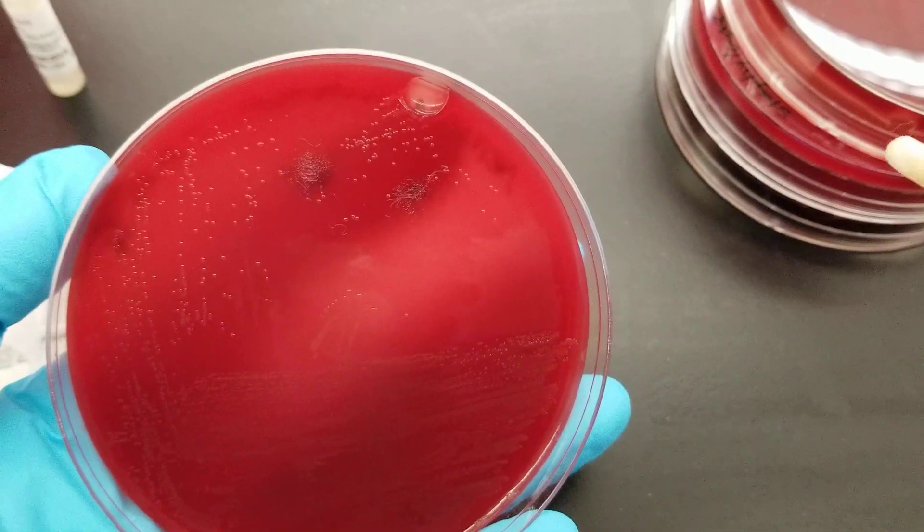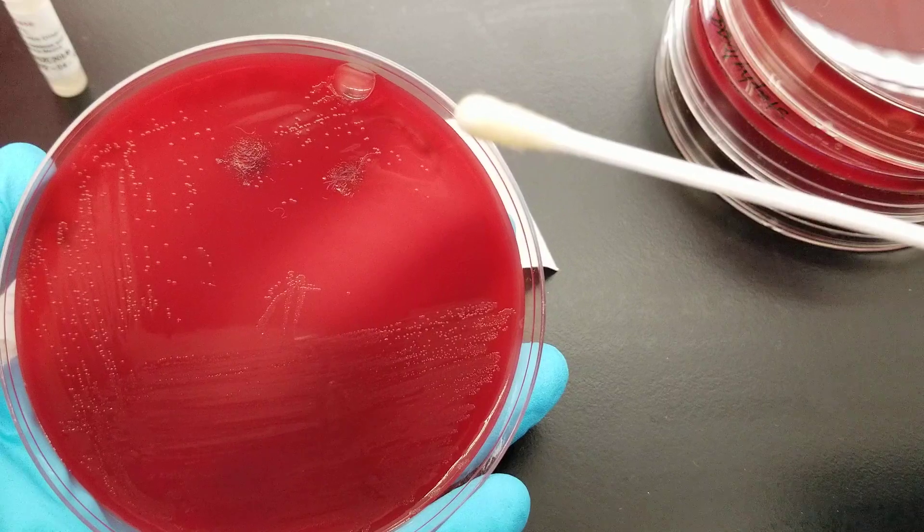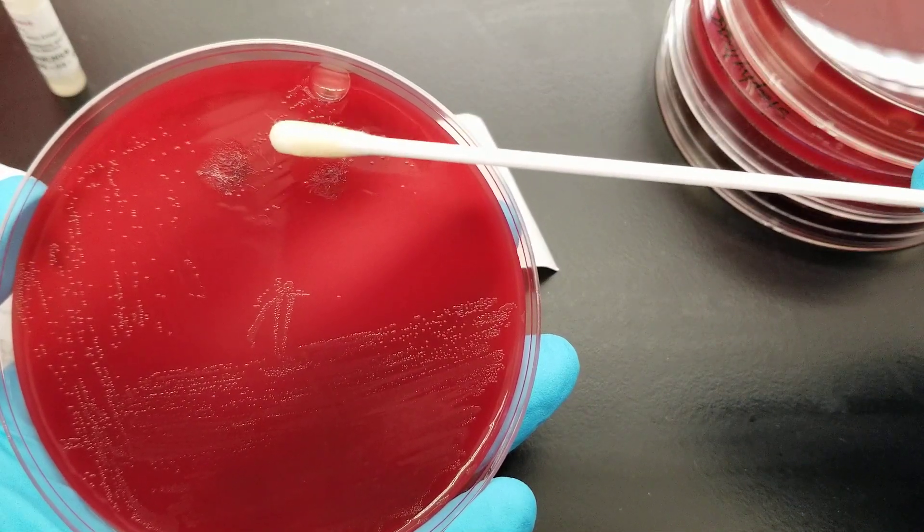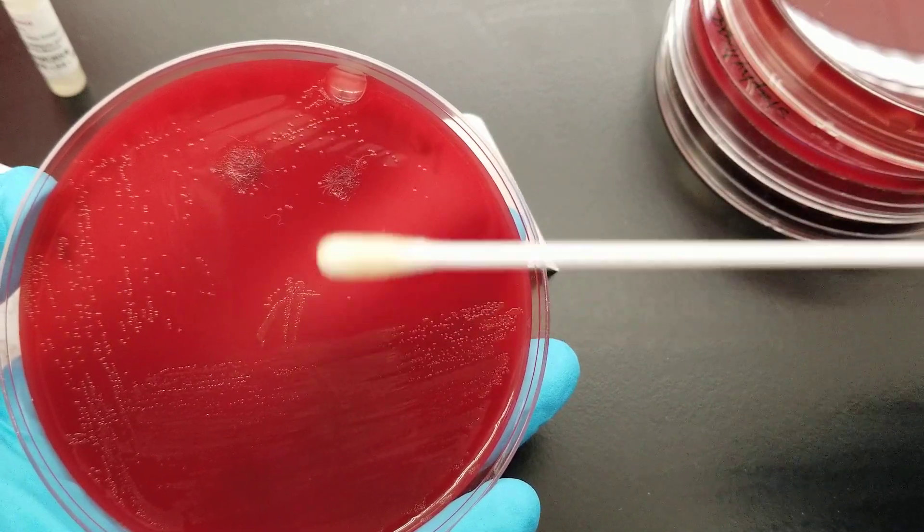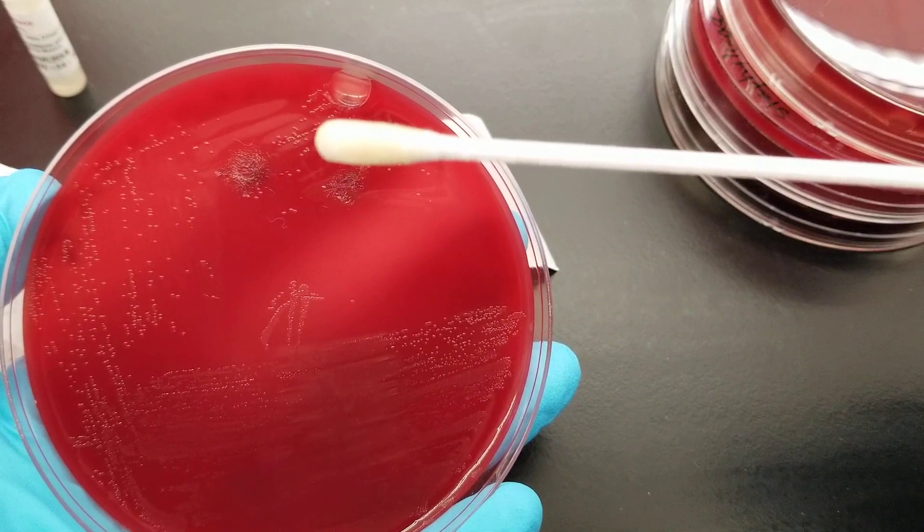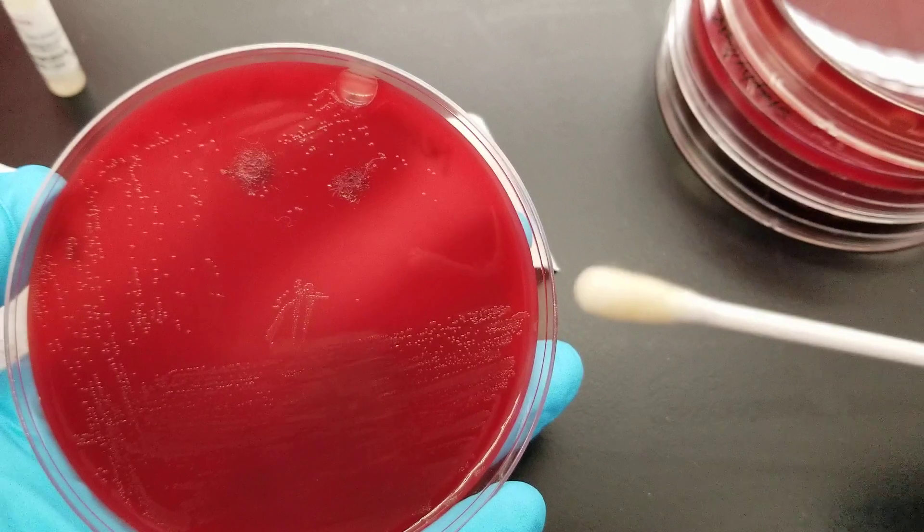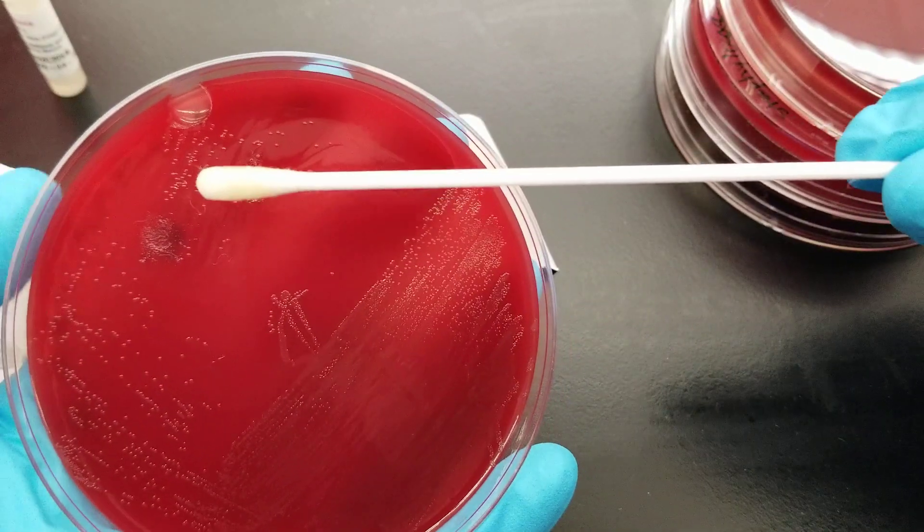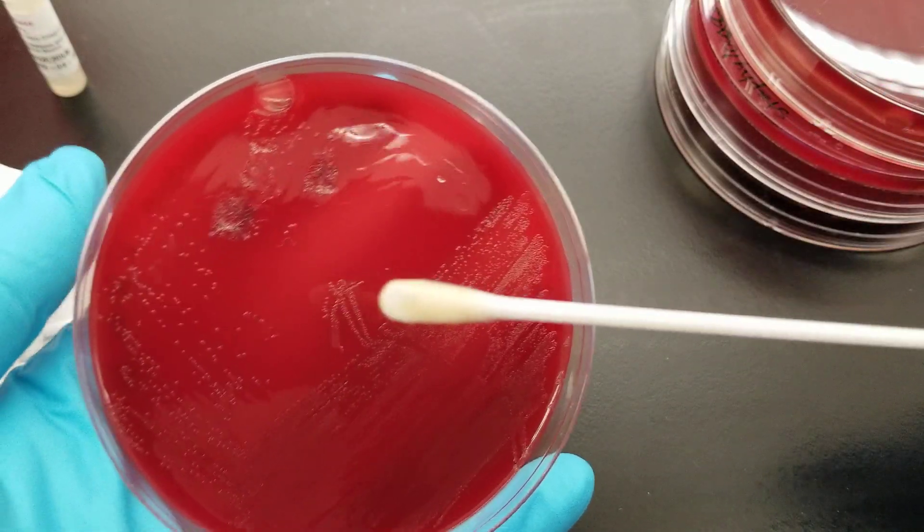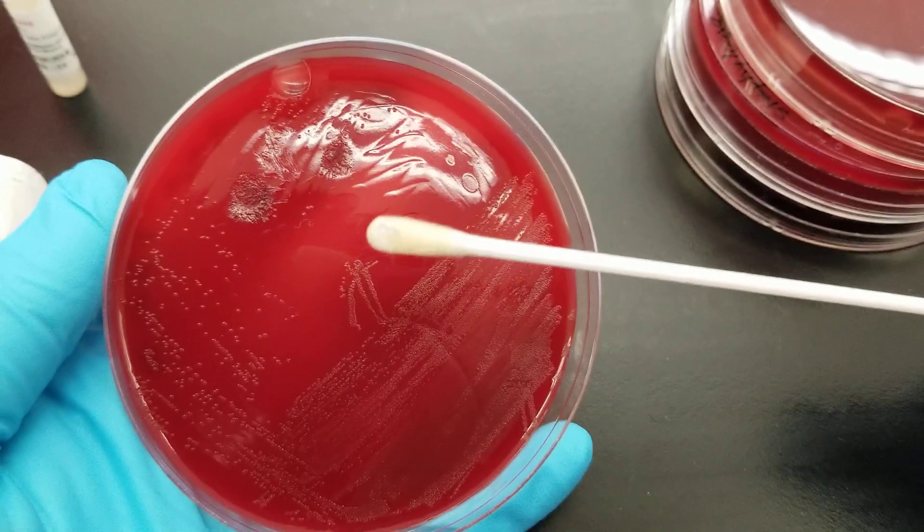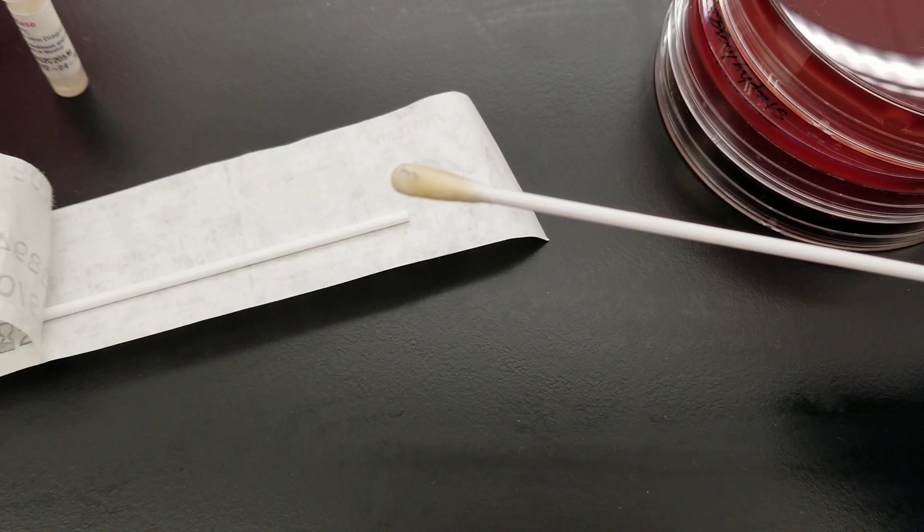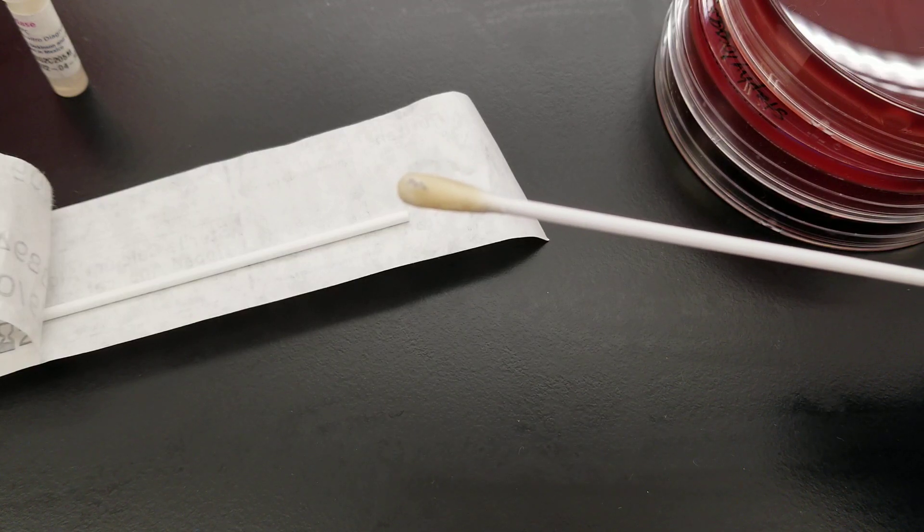Make sure that the wet part of the swab is going to go onto the colonies that you want. This is a pure culture. If it was not a pure culture, you'd want to go out to where you have a particular colony that you want to test. So I'm going to go and pick up some from the pure side and you're looking for an immediate change. That is purple. You can see it right there. An immediate change means that it's positive. You're looking for blue or purple.